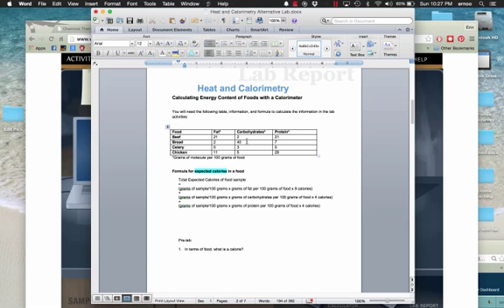So I'm just going to do an example actually. So for bread, I would do 2 divided by 100 times 9 plus 40, or I'm sorry, grams of sample. So let's say that I had a 10-gram sample.